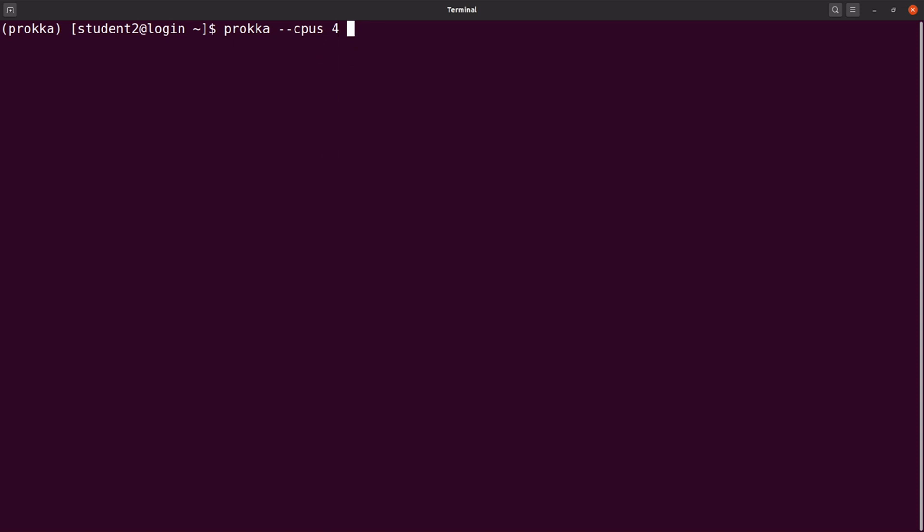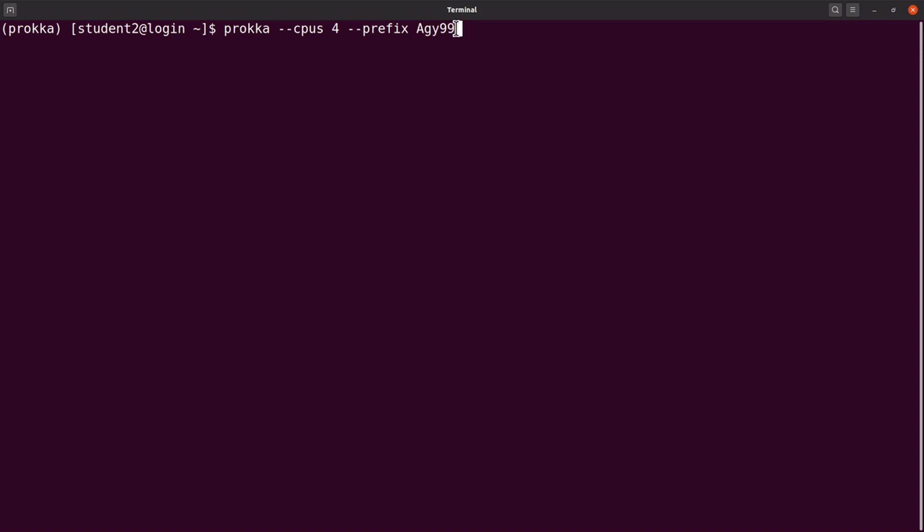We also specify prefix. We have the prefix here. Let's say this annotation process. The prefix allows all output files to have agy99 in their names in addition to their respective file extensions.